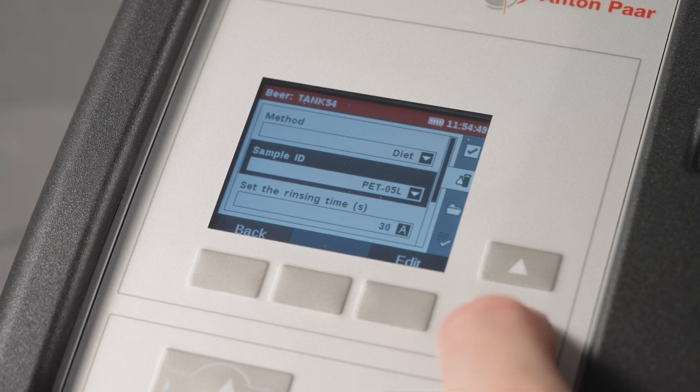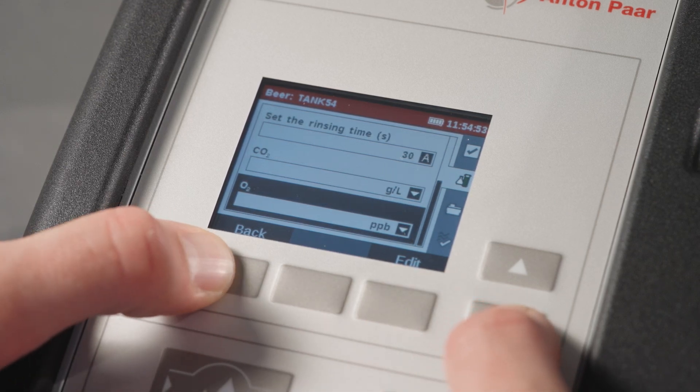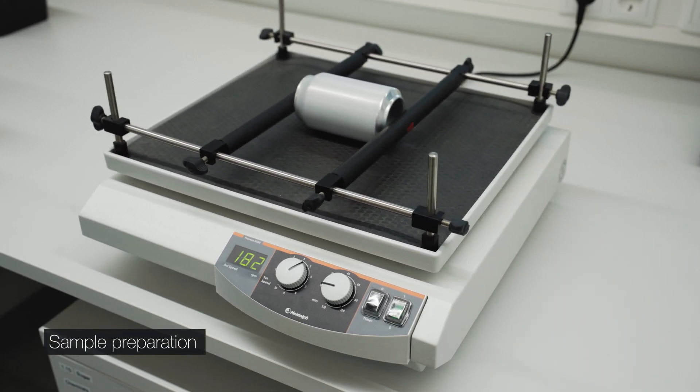Set the rinsing time to a minimum of 30 seconds to fill the measuring chamber and avoid sample carryover. Always measure samples at a consistent, stable temperature.